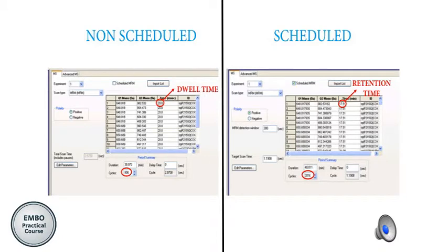Here is a picture of where we set up the method. In a non-scheduled method there is a column for dwell time and the cycle time is fixed because it is always cycling through all transitions.